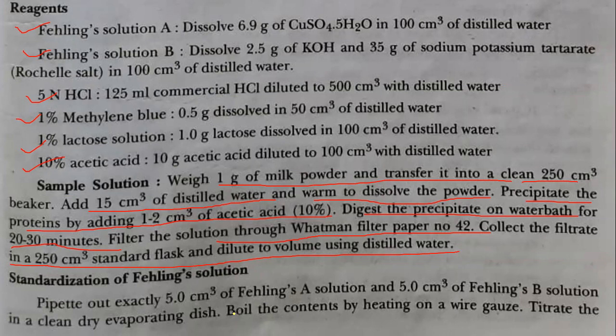Digest the precipitate on a water bath for half an hour. Filter the solution through Whatman filter paper number 42 and collect the filtrate in a 250 ml standard flask and dilute it up to the mark.